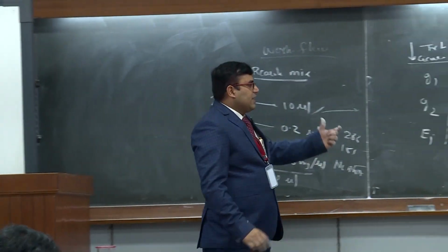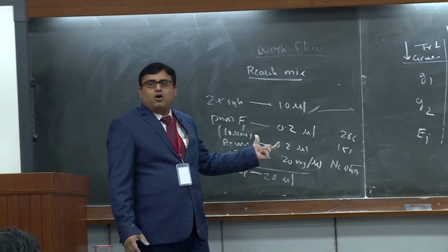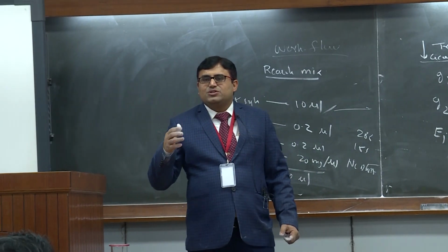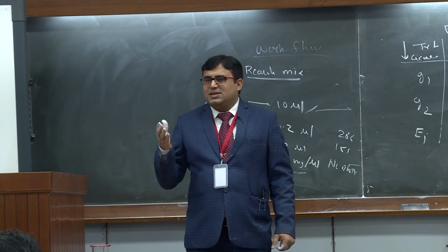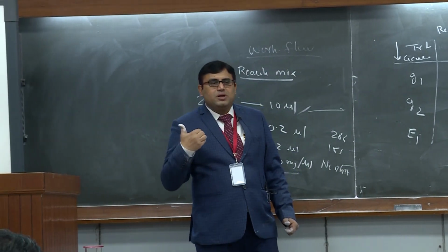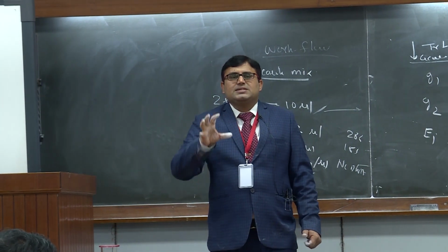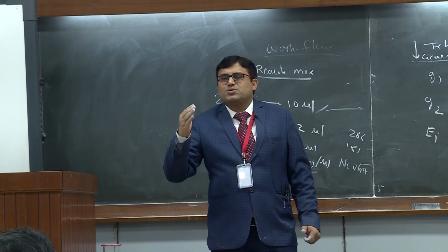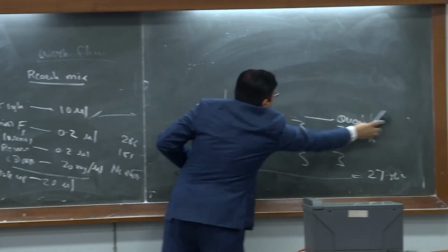Right? So once you calculate the reactions, you know the volume of ingredients which you have to take per reaction. So next is how to make a reaction mixture, because this is very dicey. If I have to pipette all these ingredients one by one, I am a human being, so maybe in one part or the other I will commit a mistake. But there is a specific method through which the chance of error will be very less. So let's see how to pipette it out.